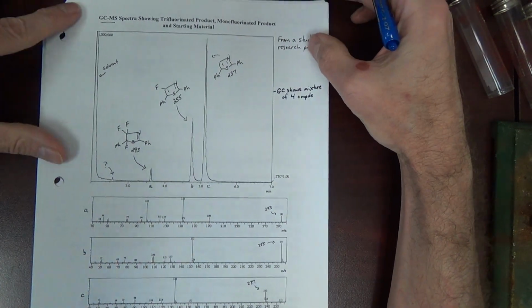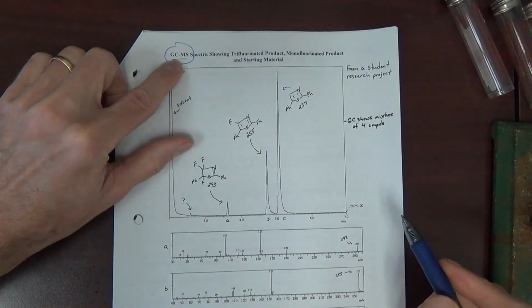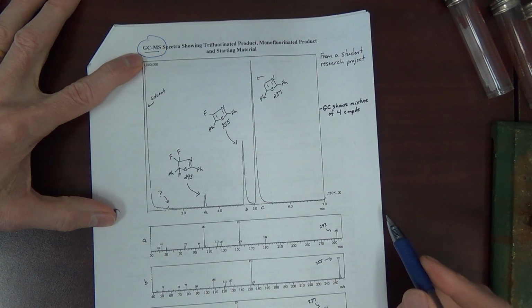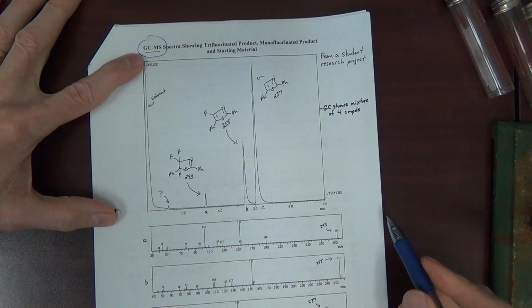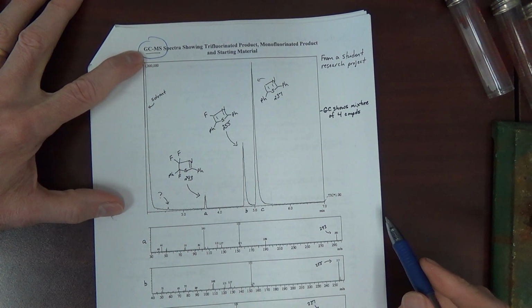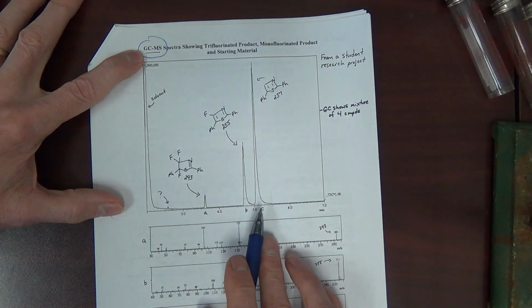Couple of miscellaneous things. Very important though. This sheet shows an example of GC mass spec. Very often mass spec is combined with gas chromatography. It's a combined analytical technique where the gas chromatography is done first. You may or may not have a pure compound. The gas chromatography will first separate components in a mixture. Then each component is sent to the mass spec and you register a mass spectrum.